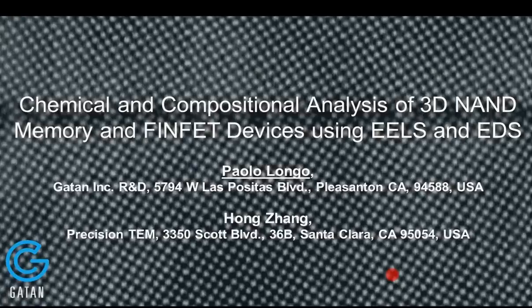Yeah, this is a fair question. We didn't use any drift correction. The data sets were taken with a maximum of a few minutes acquisition time, so there's no real need to use drift correction. The instrumentation was stable enough. Obviously, if you use drift correction, you will increase the total exposure time and the dose onto your sample, because you still need to take an image to do cross-correlation. So ideally, you don't want to use drift correction, provided that you have a stable system. But going fast and having a sensitive camera helps, because you can use a short exposure time. The other question was about collection angle, right?